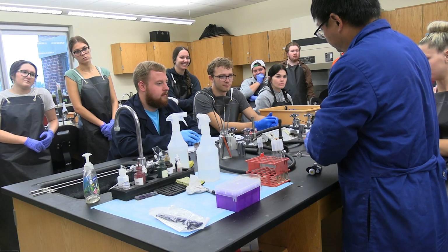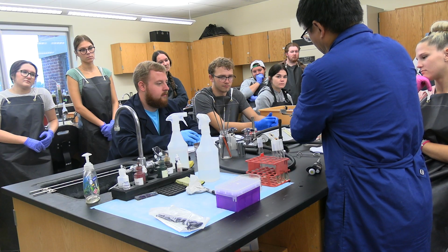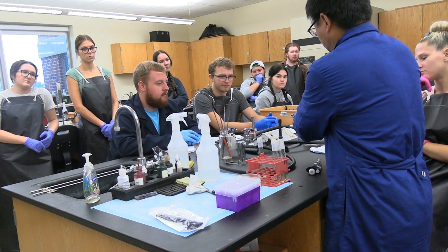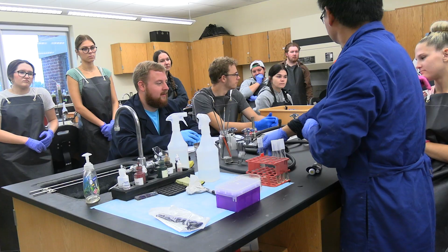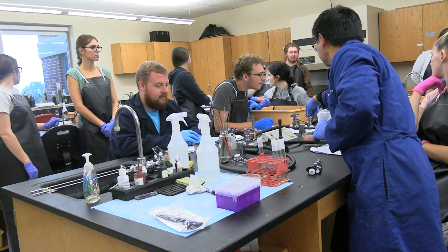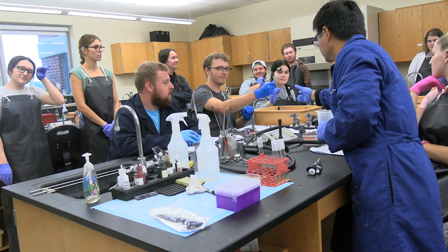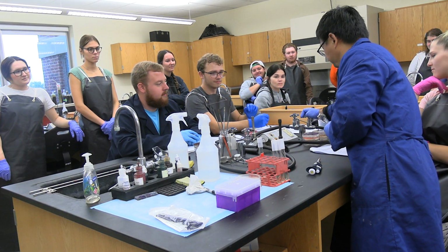This way. New one. Can I have a new one, thank you. Well, these are not good.